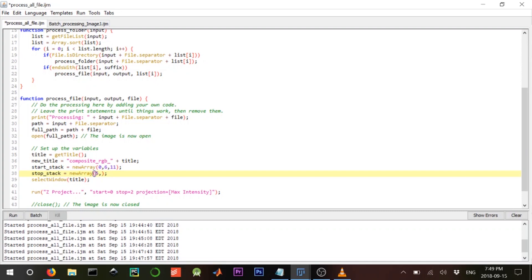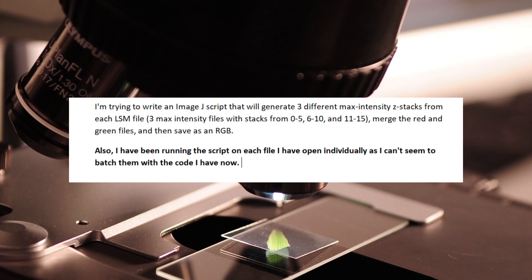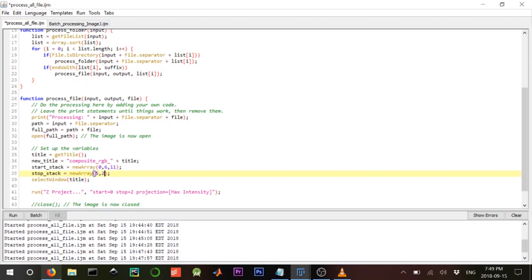And then the stop_stack array will be: five, ten, and fifteen. That will be the start_stack and stop_stack arrays.